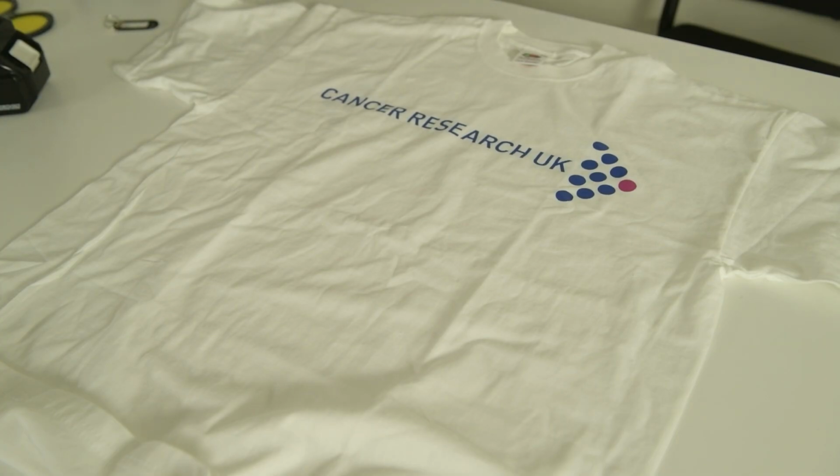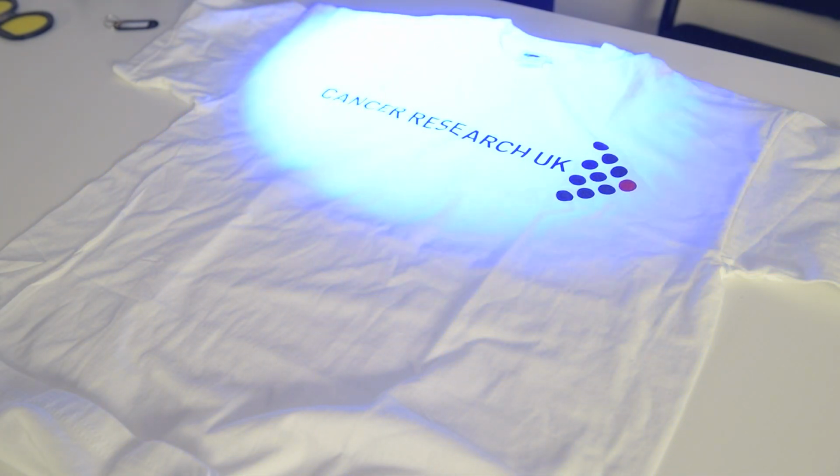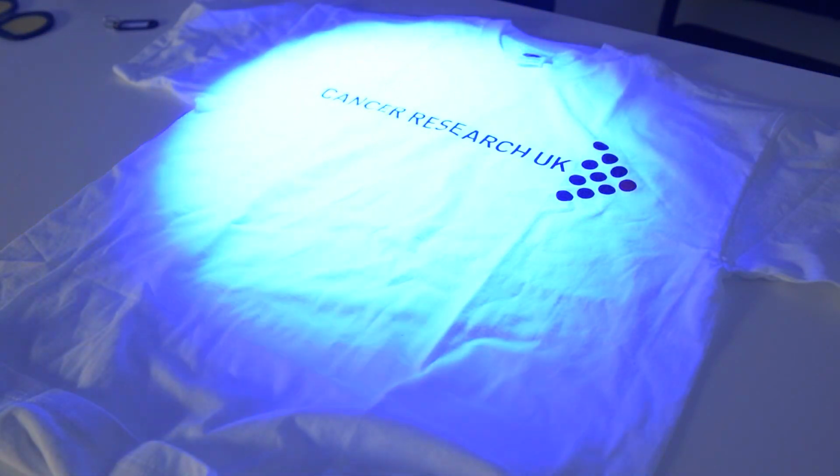Easily, the most common wavelengths used to search for fluorescence are UV and blue. Generally, these two wavelengths are incredibly successful. However, if I turn on a UV light to try and search for the accelerant that has been deposited on this surface, you can see that there is just an overwhelming amount of fluorescence being emitted by the surface itself.